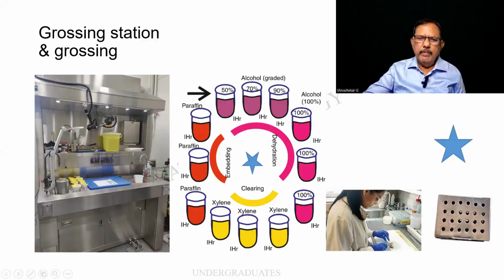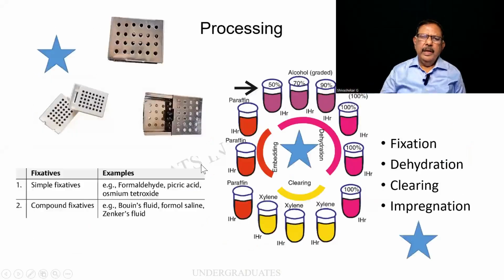Earlier, all this was manually done. So remember, fixation already done. Then there is a dehydration, there is a clearing, there is an embedding in paraffin. It goes. Again, I repeat, processing. Repetition is the mother of knowledge.